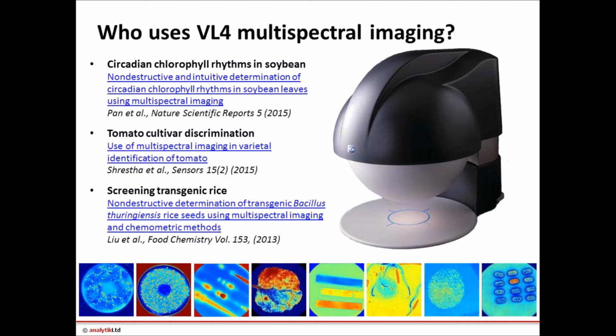There's quite a good example just recently in the journal Plant Genetics, on using these multispectral images for seed bank, gene bank accessions. So we can relate the genes and the phenotype in a very close manner and have a real valuable database of these multispectral images that you can collect easily and store away for future use.